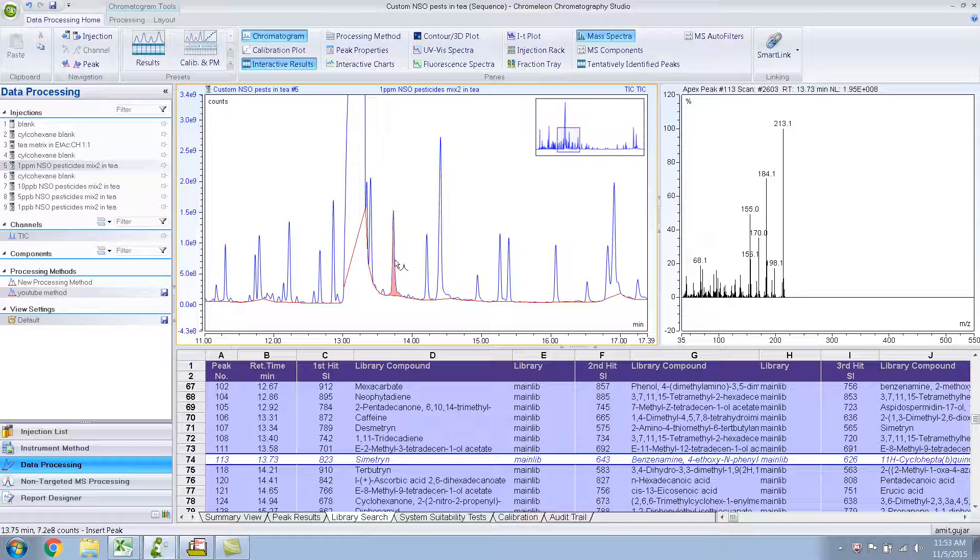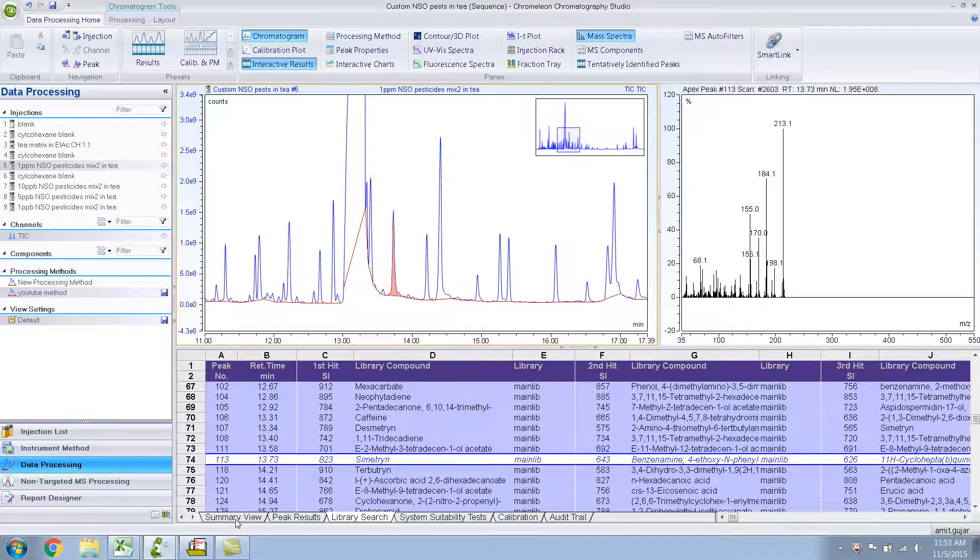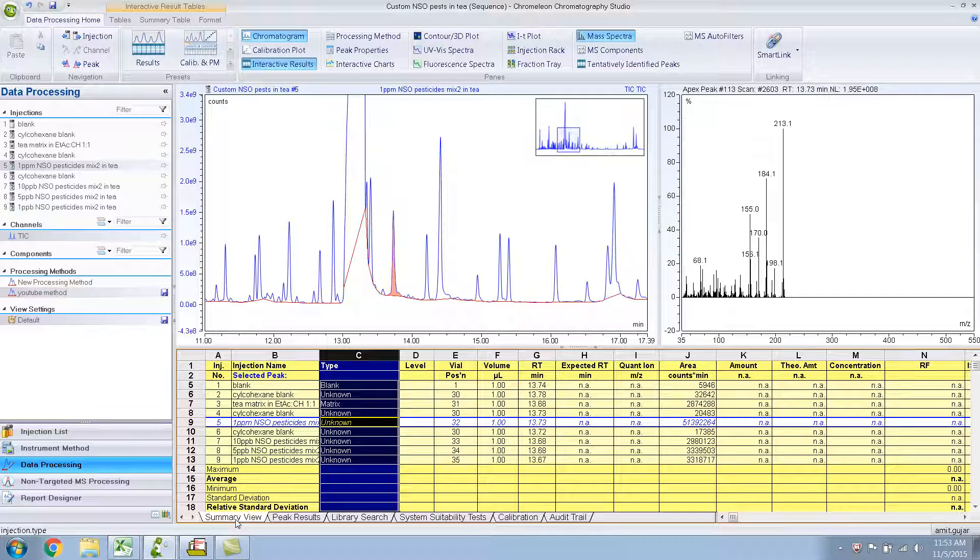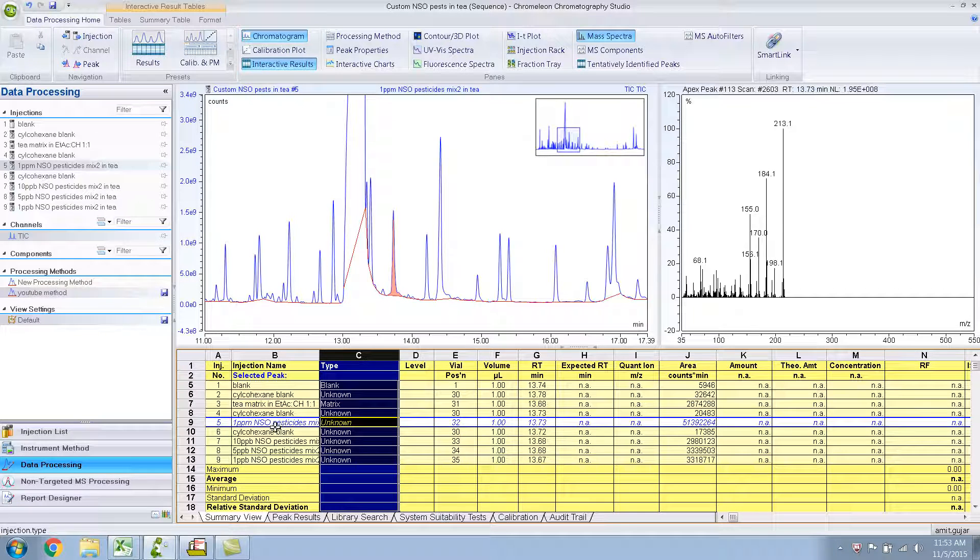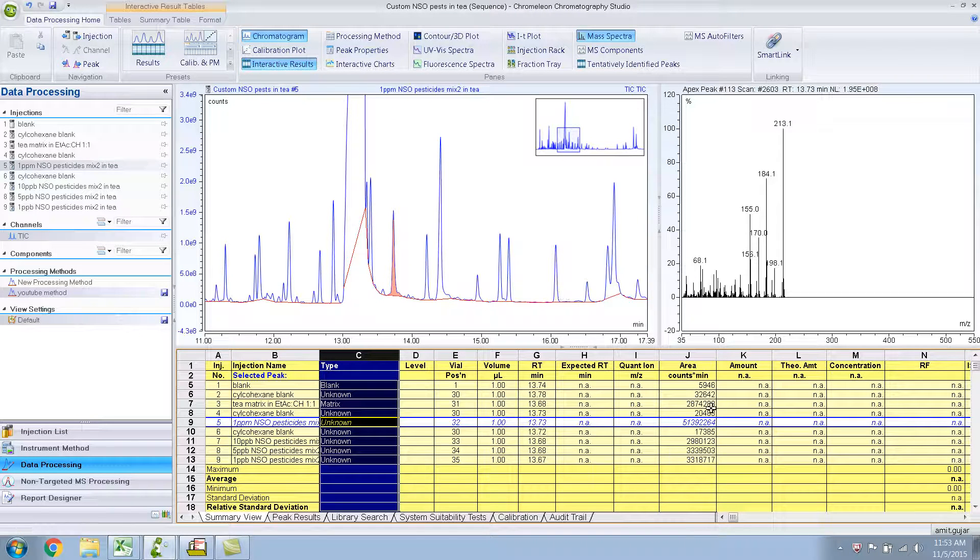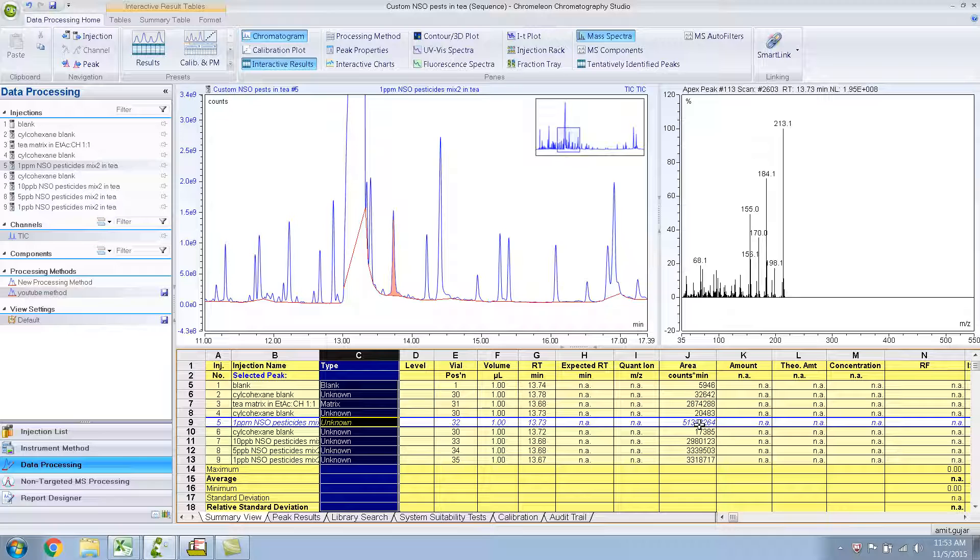Suppose I wanted to know more about this peak, what is the peak area. You would just go to the Summary View over here and you'll have the peak area for that particular peak, for that particular injection. This is at 1 ppm injection. This is the area for the TIC, that is the total ion chromatogram.